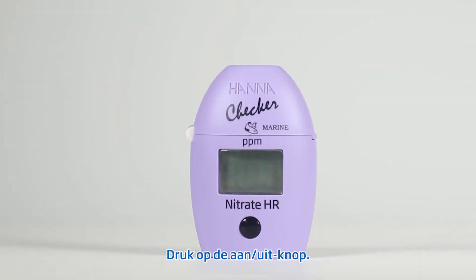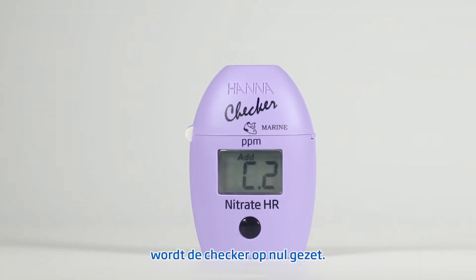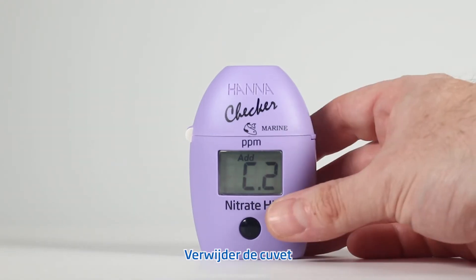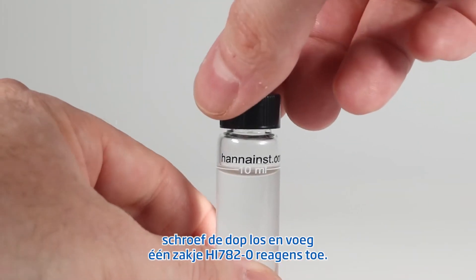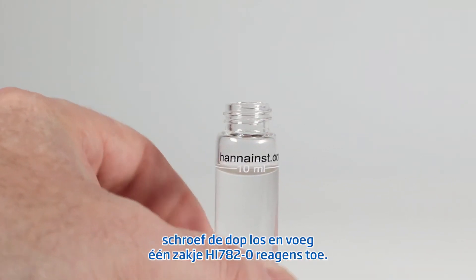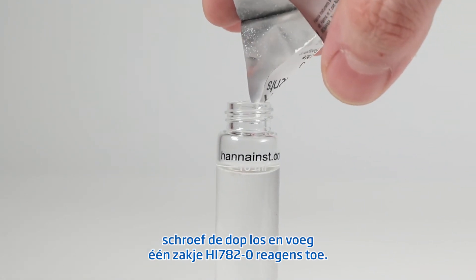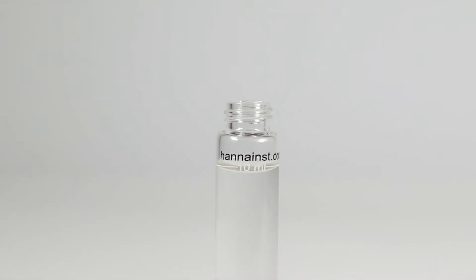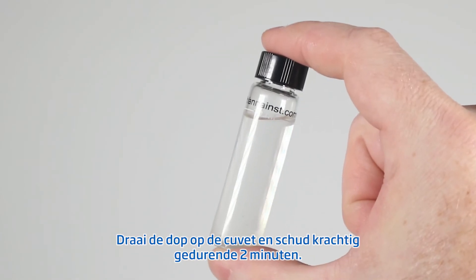Press the on-off button. When the display shows 'add C2' with press blinking, the checker is zeroed. Remove the cuvette. Unscrew the cap and add the content of one packet of HI782-0 marine nitrate high-range reagent.